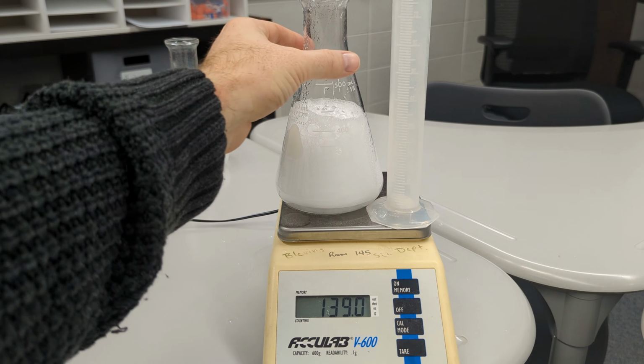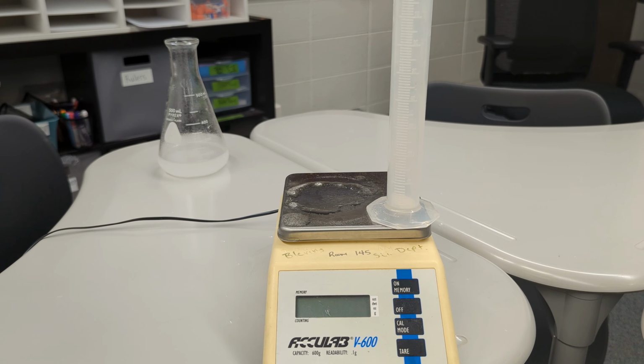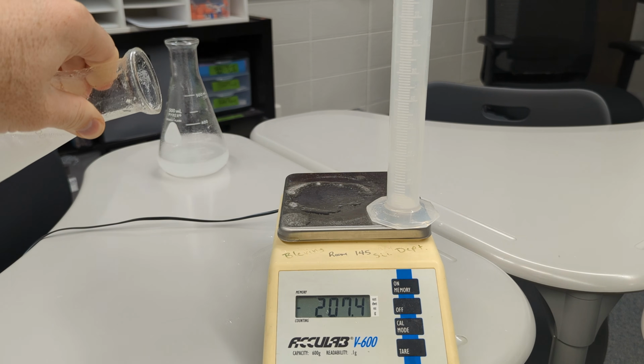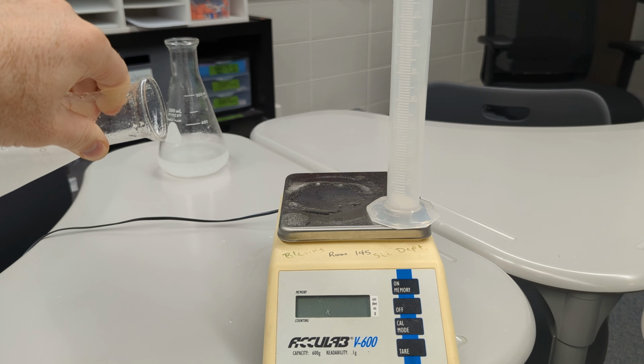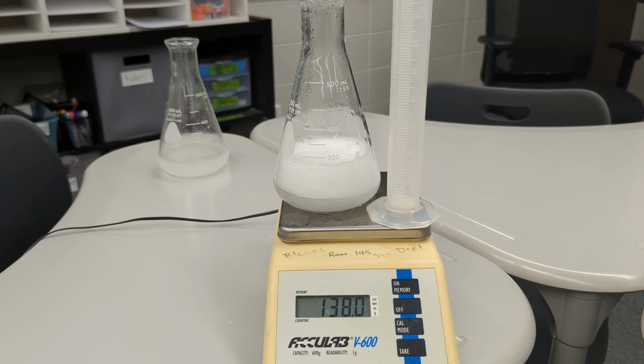you can't see it. But I should be able to get rid of a little bit of mass just by pouring out the gas. So I'm not actually pouring any liquid. I'm just trying to pour some of that invisible gas out. And it should drop quite a bit from where it was. I don't know if that'll work or not. I'll have to double check the data. But there you go. That's the reaction with and without a closed system.